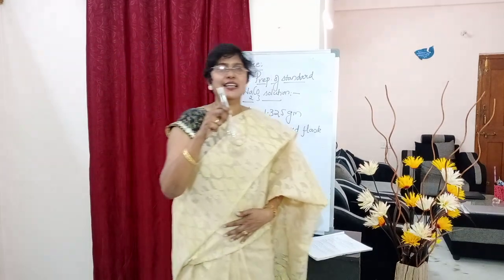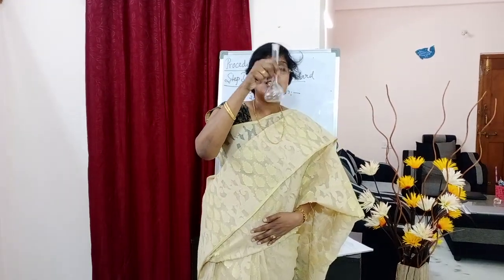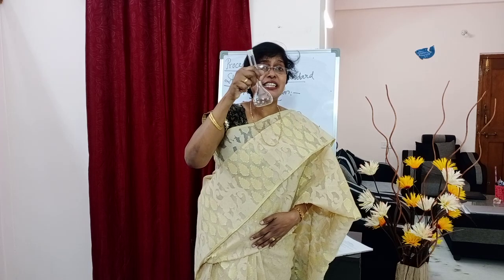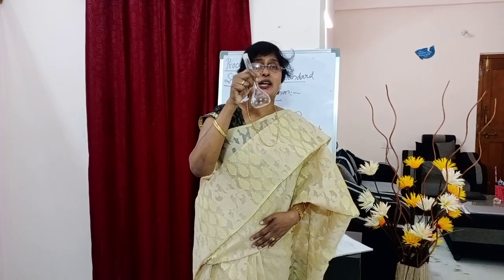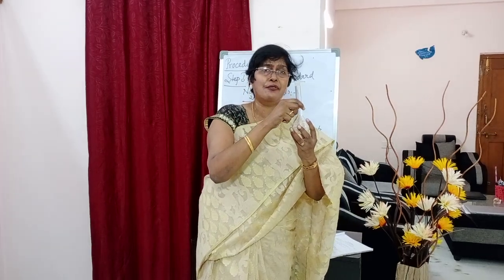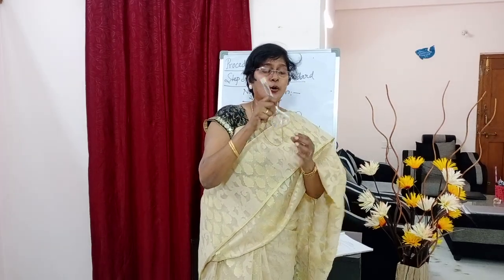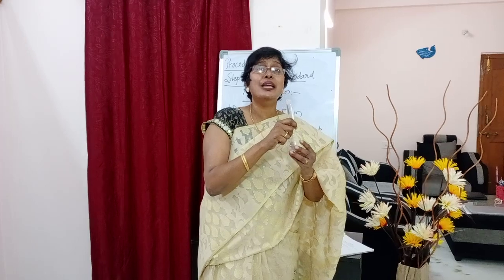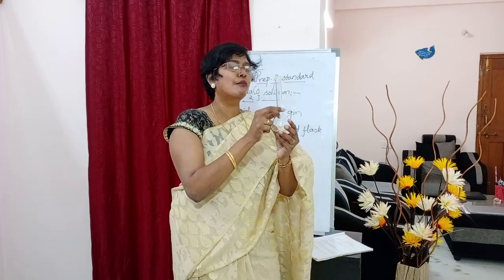Some water is there, so try to shake this flask. Try to dissolve the substance in a little amount of water first. Don't pour a full flask of water and then try to dissolve. Use some water and dissolve the substance. Then you should make up the volume to the mark, students.